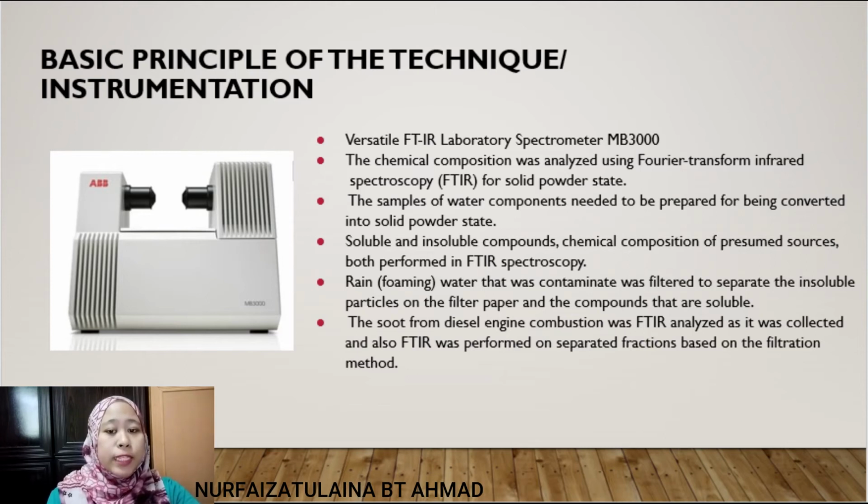The soot from diesel engine combustion was FTIR analyzed as it was collected, and FTIR was also performed on the separated fractions based on the filtration method, meaning that the soot was mixed with water, left for 48 hours and then filtered, resulting in particles on the filter paper as a solid phase and a liquid phase that could contain soluble, miscible compounds with water, particles that form bonds with water such as H-bonds, van der Waals interaction, and surfactants that also bind with the water through their hydrophilic region and are small enough to pass through the filter paper.